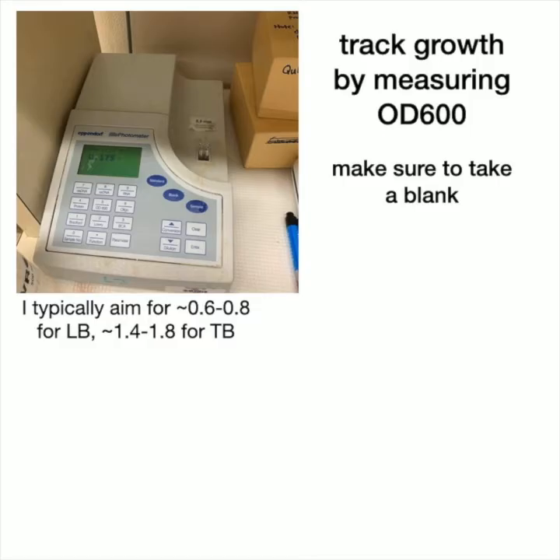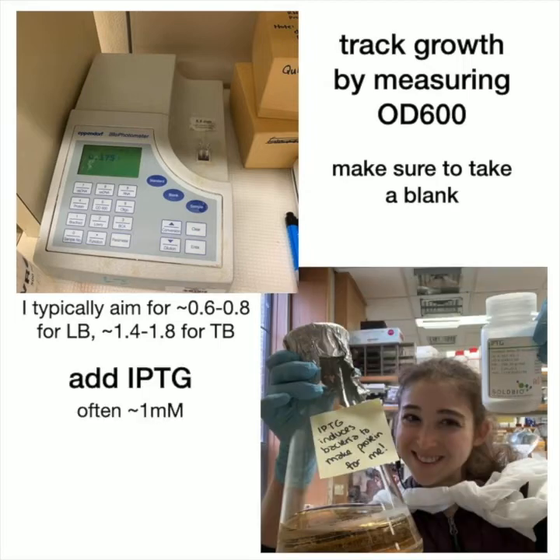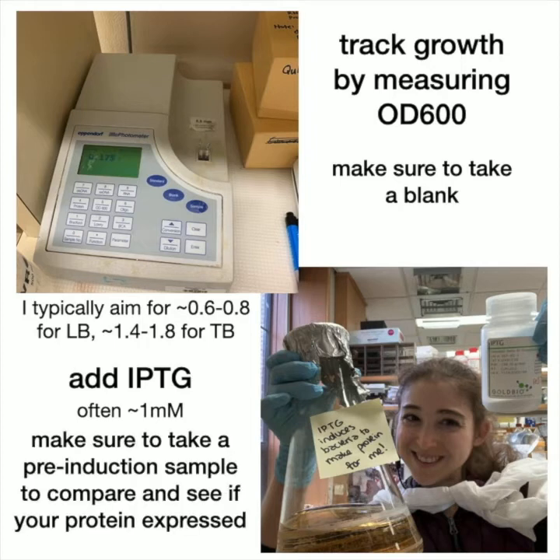You let the bacteria grow to get a large workforce of bacteria, so you want to have lots of bacteria. Then when you add the IPTG, the bacteria stop growing and focus almost entirely on making your protein. You can end up with about half of the protein being yours.